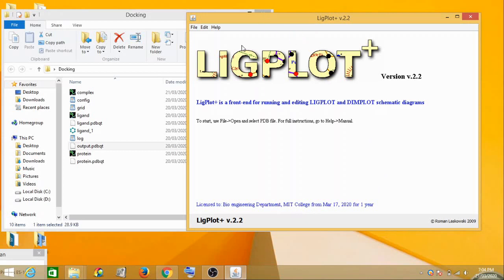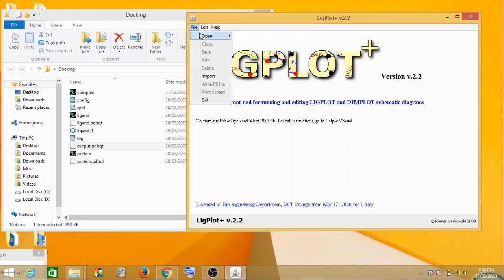The name of the tool is LigPlot Plus. So how do you do it? Go to file, now to open a PDB file.